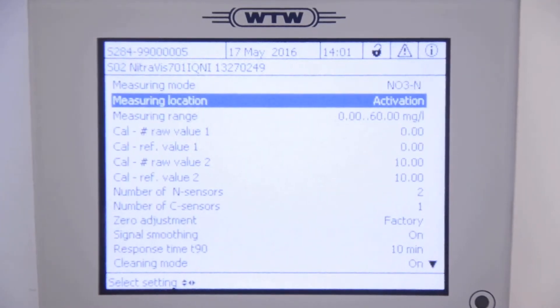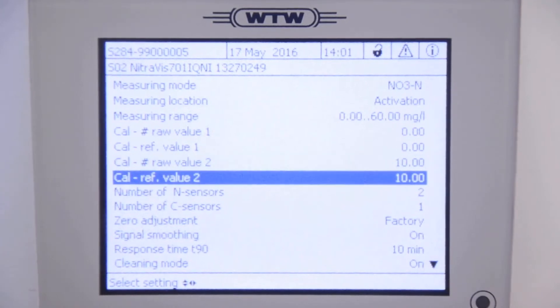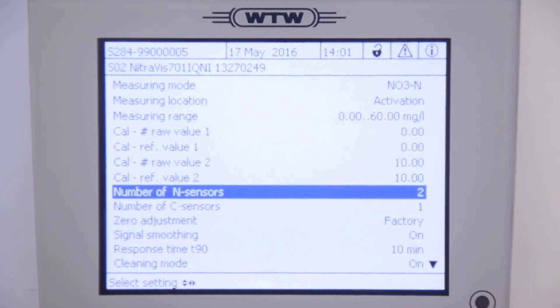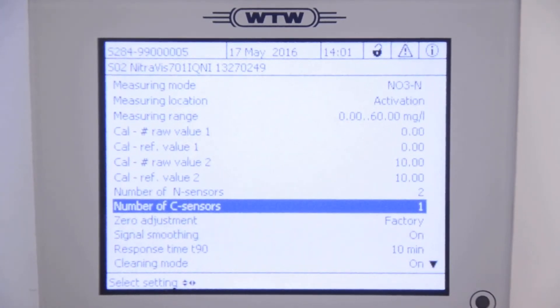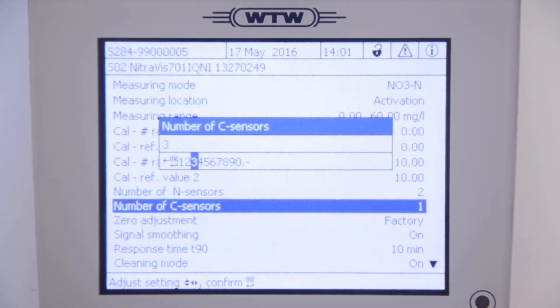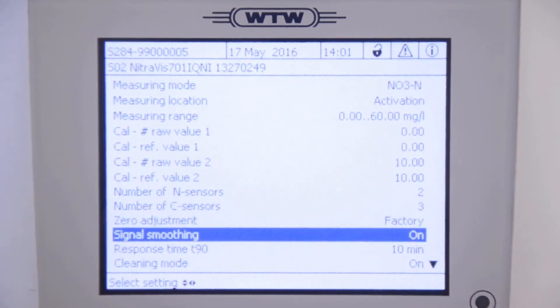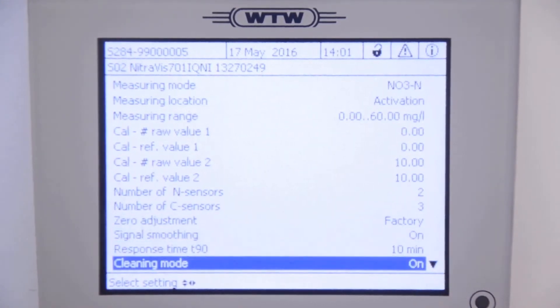Navigate to the number of C sensors item. Enter in three for the total number of carbon sensors needed, and then press save and quit.